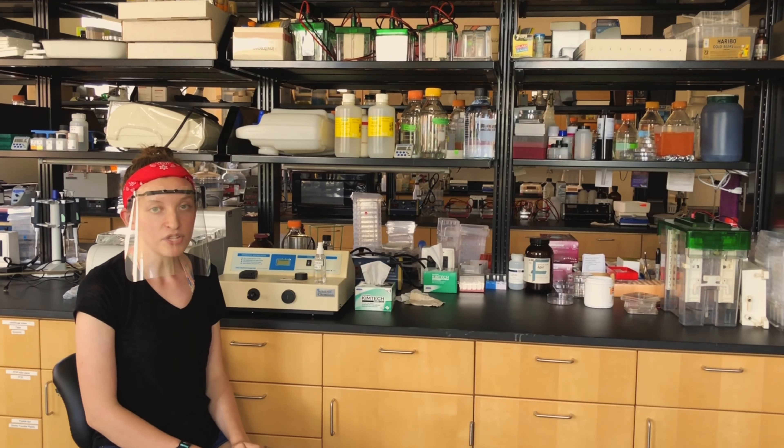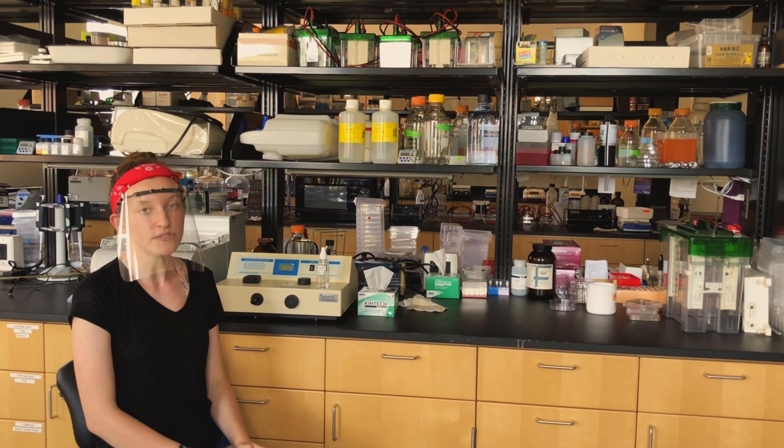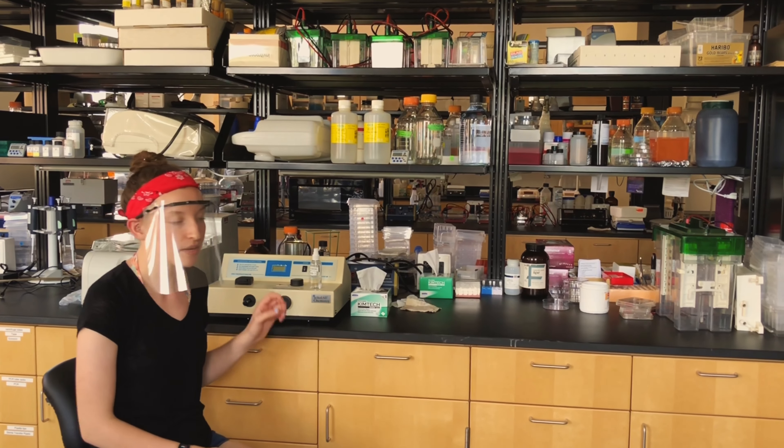We highly recommend bringing a second mask to lab so you don't have to touch your dirty mask at the edge. After you put on your face shield, the next thing that you have to do is spray your work surface with 70% ethanol.